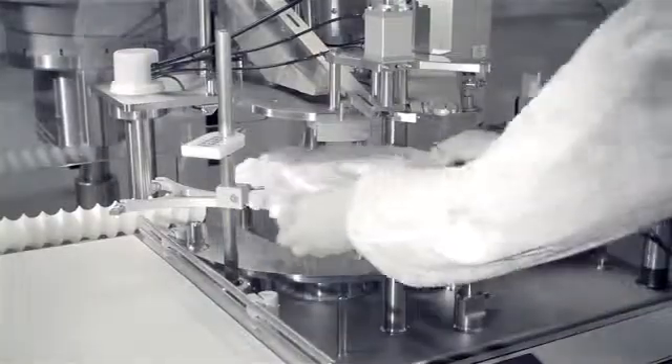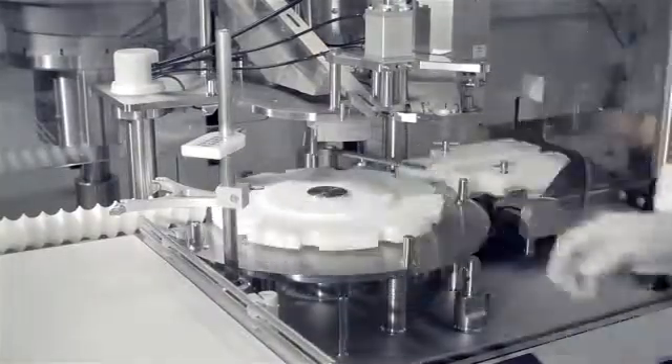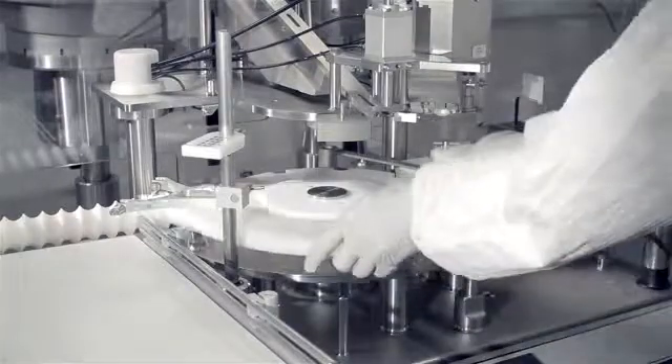A production run can be set up in under 20 minutes, and the total capacity per working day is unique for this size of filling and capping solution.